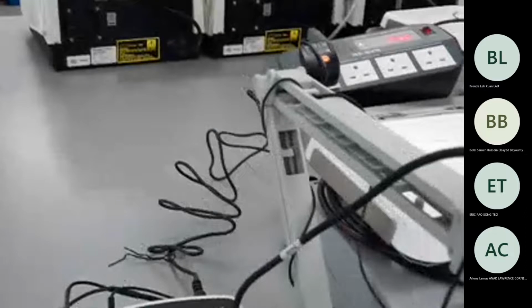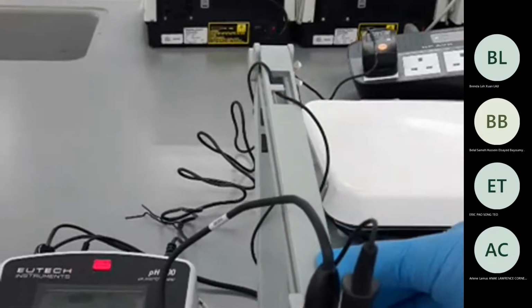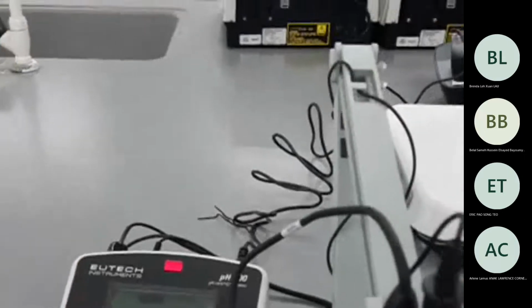So this is the distilled water. I'm taking the pH for the distilled water, and it shows that it is around 4.5. It's not ready yet.